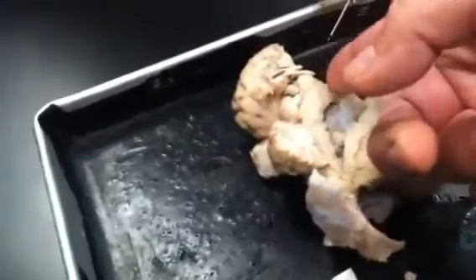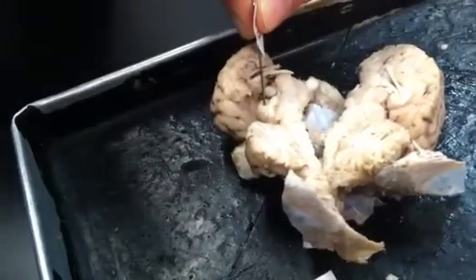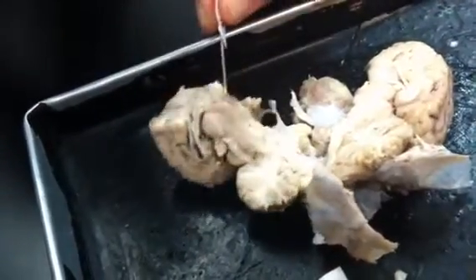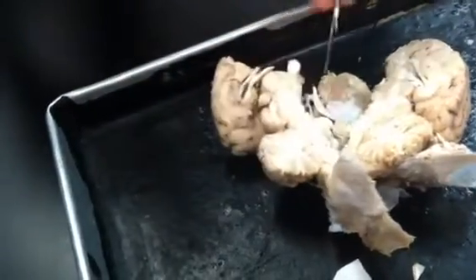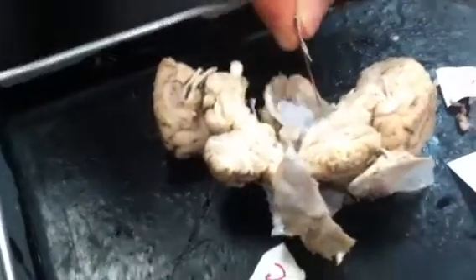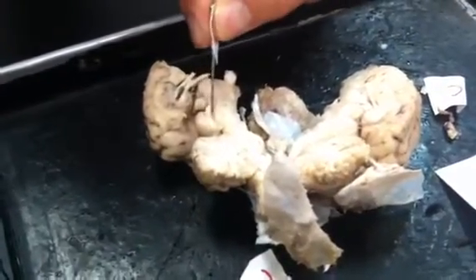Where's the pituitary gland? Is that the pituitary gland right there? No, that's the pineal. We're on the top of the brain, so that wouldn't be pituitary. No, this is the pituitary. No, that is a cross section of the optic chiasm. Exactly. The pituitary is attached to the dura mater. It's still attached to the dura down here. You don't see it unless you look underneath. So anyway, that's the corpora quadrigemina.